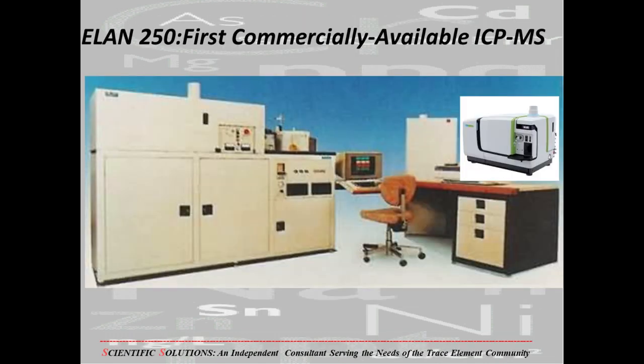To put the instrument size in perspective, let's compare the oldest and latest instruments in the last slide. I worked on the Elan 250, which was the very first commercially available ICP-MS system, introduced at the 1983 Pittsburgh Conference in Atlantic City. This was developed by SCIEX, a Canadian company, which PerkinElmer formed a joint venture with in 1984. This slide shows the Elan 250 and the PerkinElmer NexION 5000 next to it, which would have fitted on the bench next to the instrument.